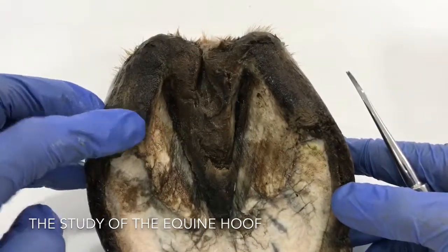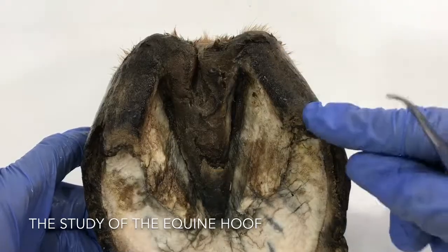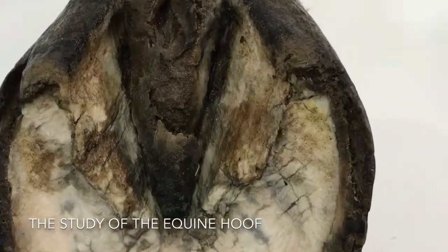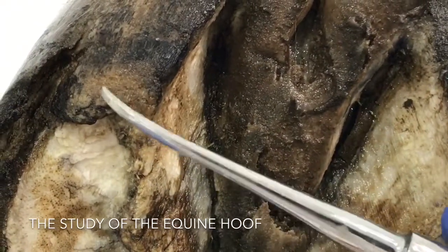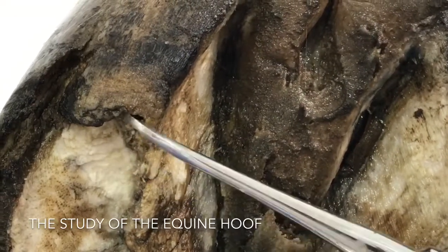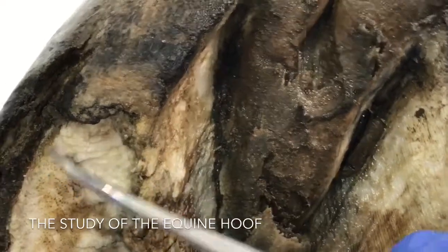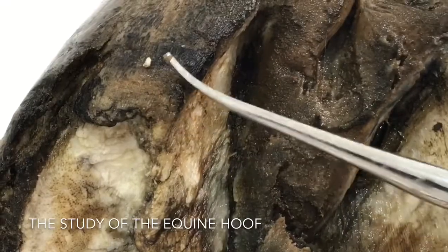We need these heels to be back here somewhere. Not only are they running forward, but they are really poor quality. The purchase — meaning where the heel actually hits the ground — is not very good; it's all raggedy and very thin all around here. This area here is called the seat of corn and it's really all overgrown, so this isn't a very strong structure.